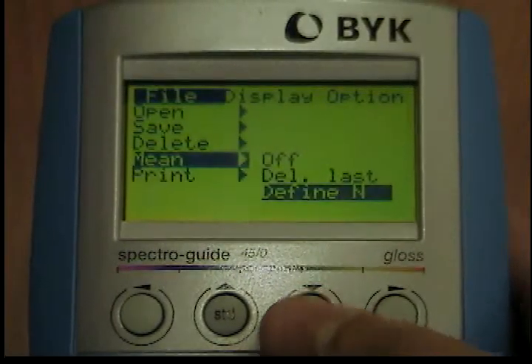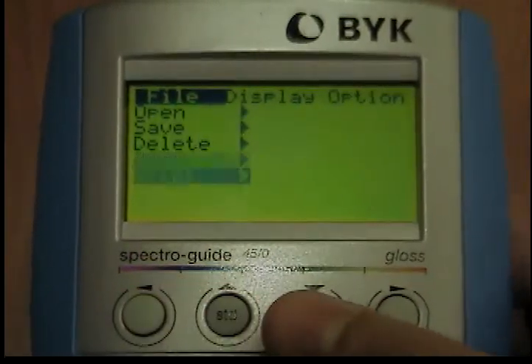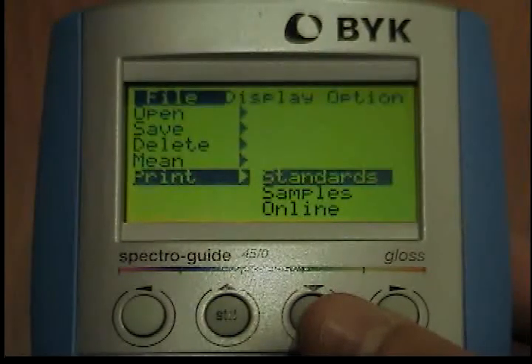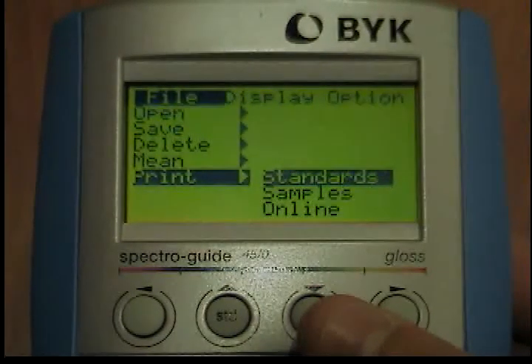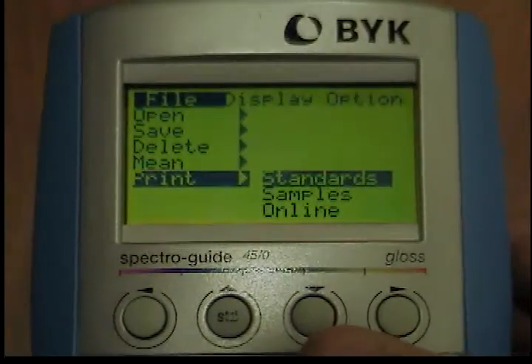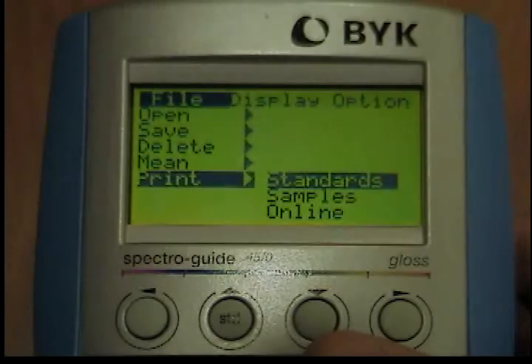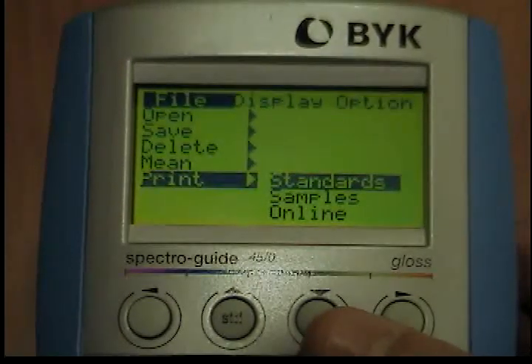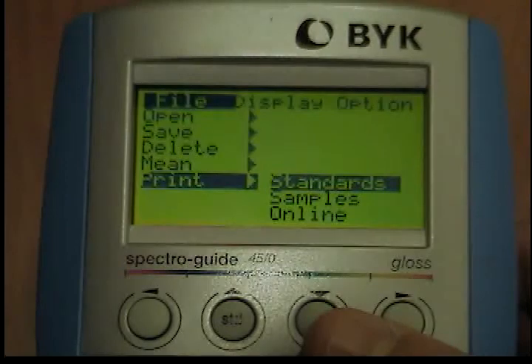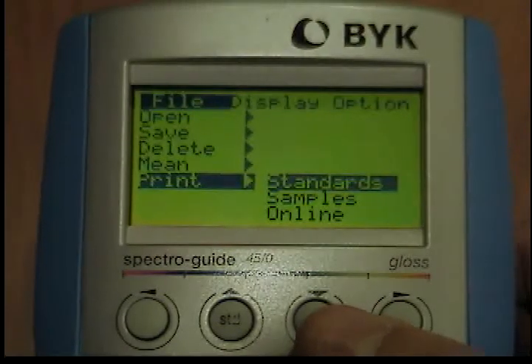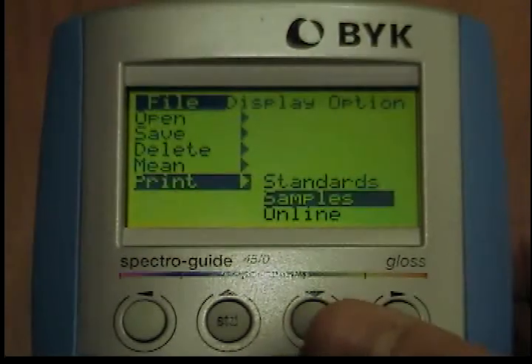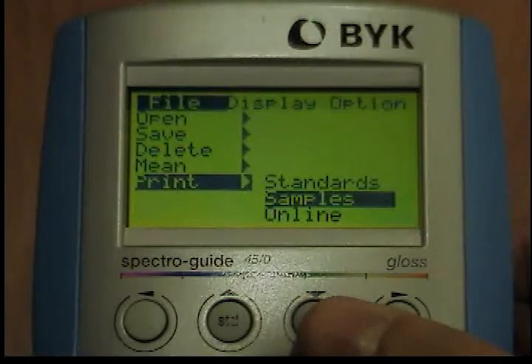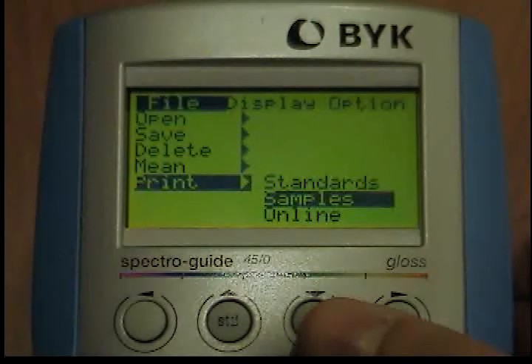Print File: you can output data to a connected printer. The following choices are provided. Standards: all stored standards are output in the format name, date, time, illumination observer, absolute measured values, tolerances. Samples: all stored samples are output in the format name, date, time, illumination observer, absolute measured values, standard name, difference values.